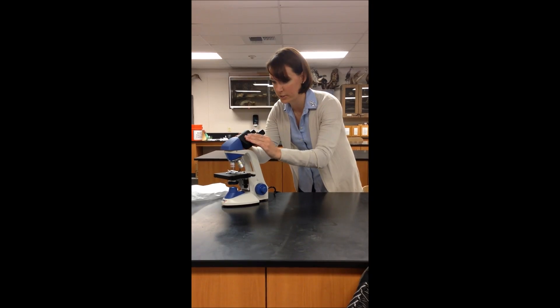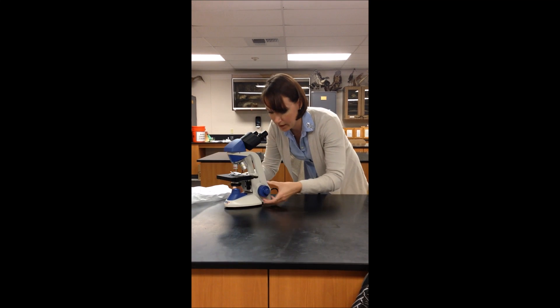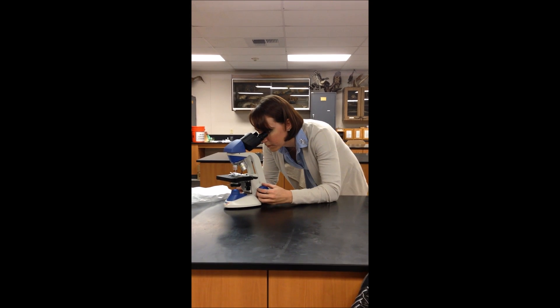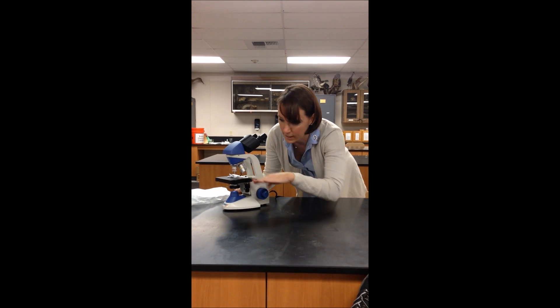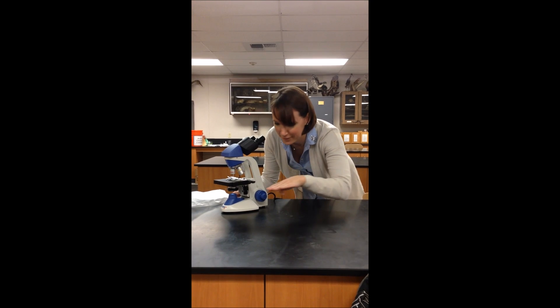These eyepieces are adjustable and can be moved to the width of your eyes. Now use the coarse focus to bring the image on your slide into view. If your slide is not in the proper position, you can use these knobs here, which will move the microscope stage top and back, left and right.